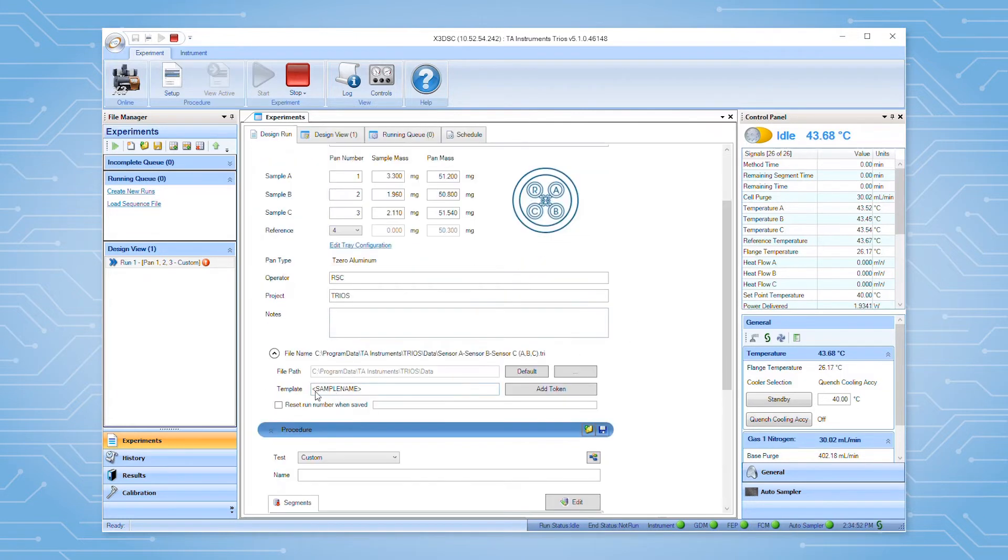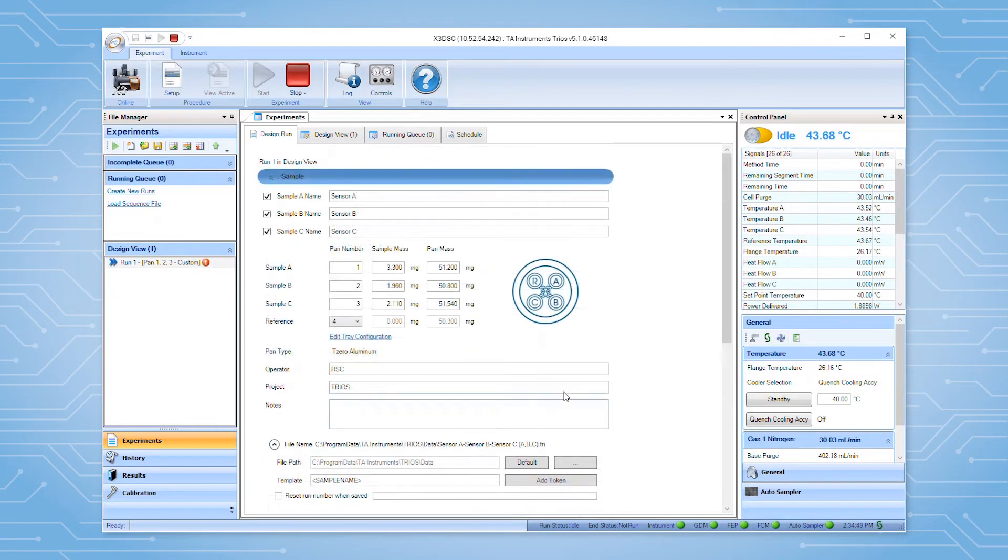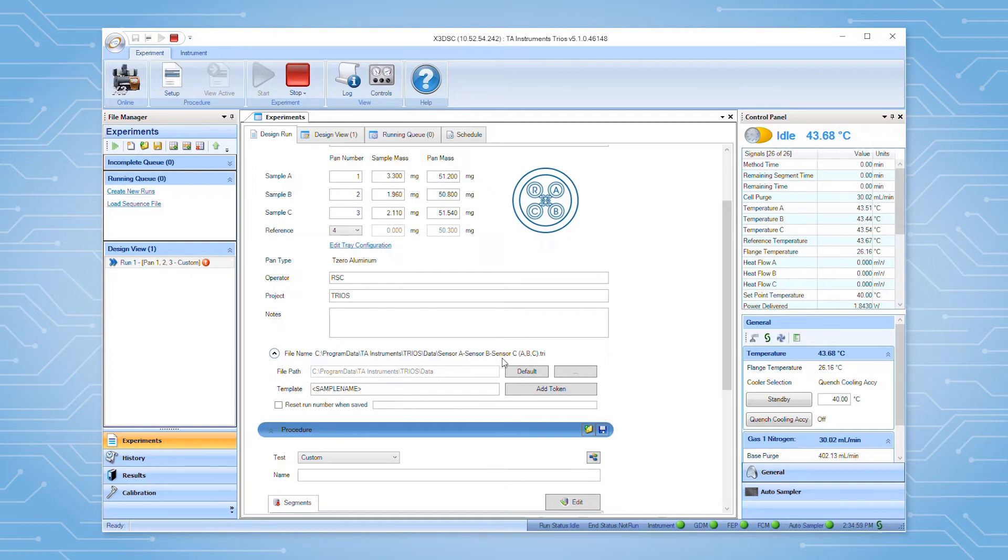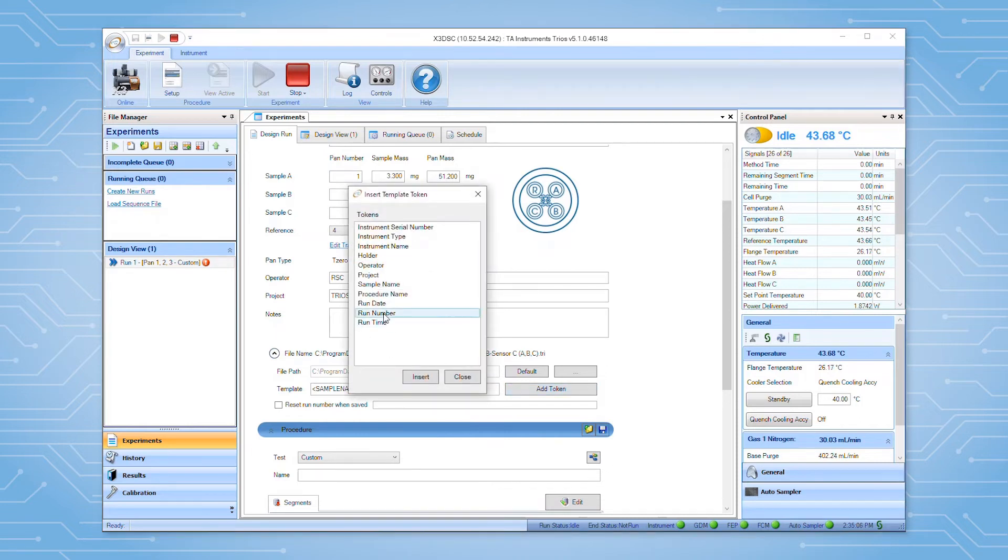If desired, data file naming can be modified in this portion of the form as well. Out of the box, TRIOS uses the sample name token when creating data files. For the X3 DSC, this token appends the names for samples A, B, and C as seen here. Additional tokens can be added by clicking the add token button and selecting from a list of available tokens.